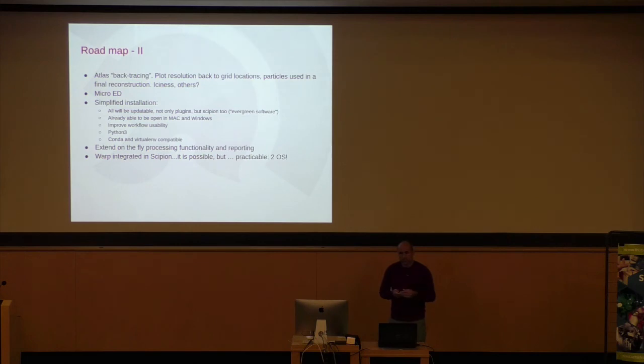We plan to improve the workflow usability, adding more features to make it easier. We will migrate to Python 3. Python 2, which is the current version we are using, will be deprecated by the end of the year, so we will update it. And it's Conda and virtual environment compatible. This is related to how easy it will be to install the next version of Scipion.